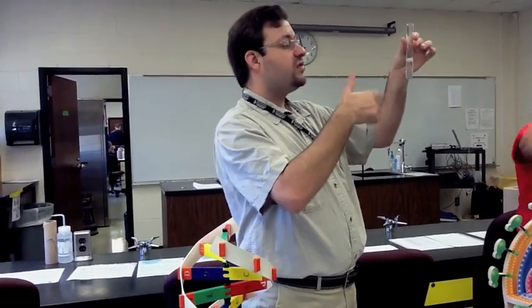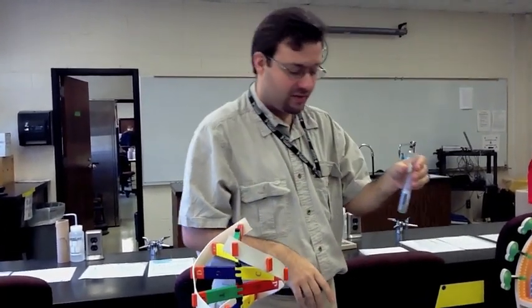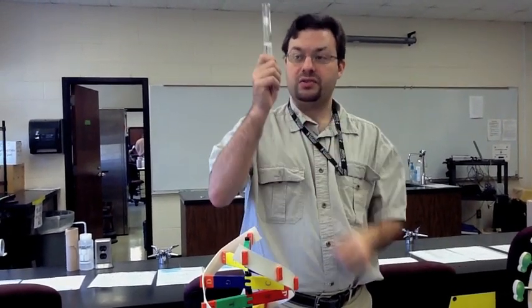Because the DNA is negatively charged and alcohol has no charge to it, it's not water, it drew the DNA up out of the solution into the alcohol. Then we took the hook, grabbed it out, and looked at it under the microscope. As far as I know, we're probably not going to have the wet mount slide of the DNA on the test. You will just have this.